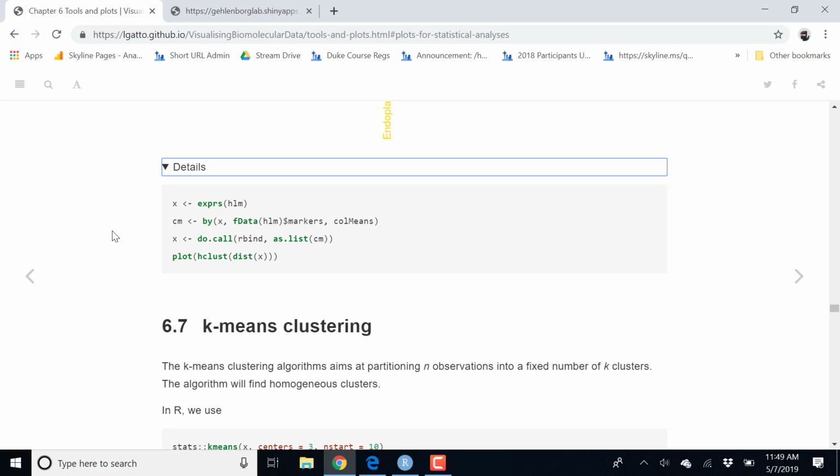So I take all the proteins that correspond to one group and call mean, which gives me a new vector where each value is the mean of all the proteins that belong to that group. Instead of starting with a matrix with several profiles per group, I end up with one single profile per group.